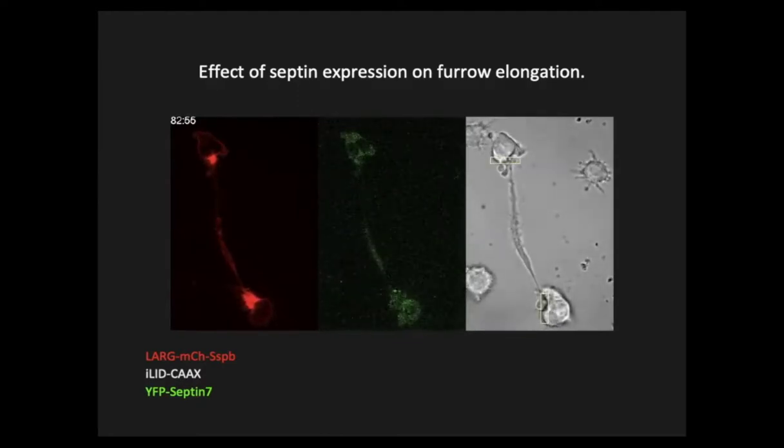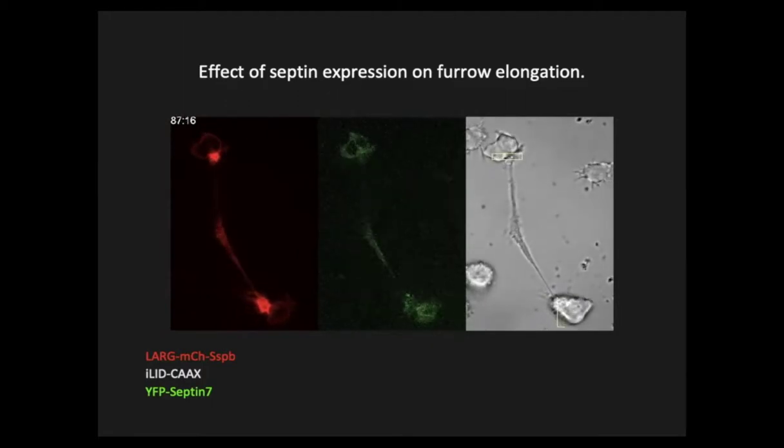As I mentioned before, septins form a ring structure and are also involved in the mid-body formation.